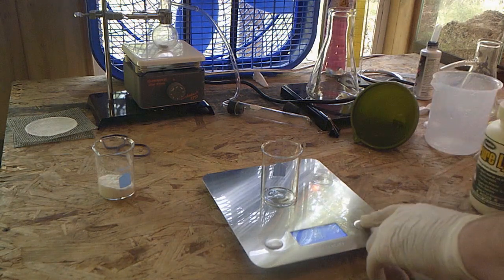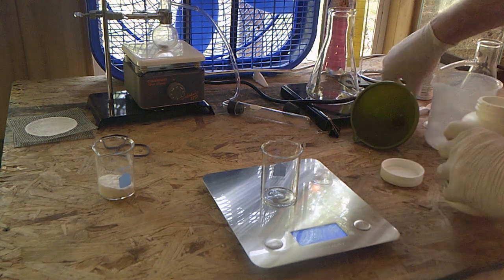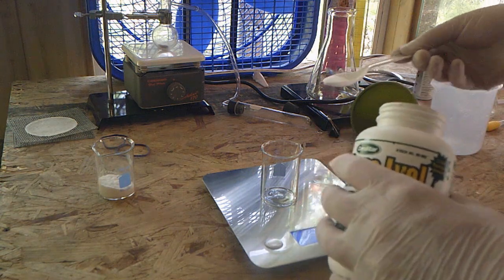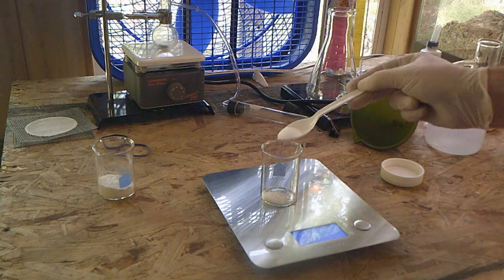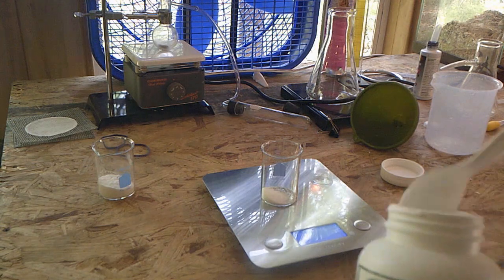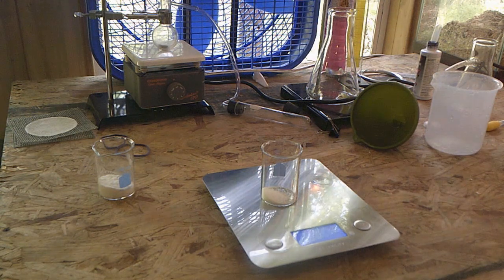So for this one, tare that off. For this one, we're only going to use about 5 grams of this compound. It's going to start in the form of a salt. Right? We talked about what salts are before. And this salt, formed between a metal and a nonmetal, is going to disassociate or fall apart in water and form ions. And then those ions are going to fly around and change the state of some of these other compounds, and that's what's going to cause the color change. So this is the base that's going to drive the chemical reaction. So now we have about 5 grams of our base.